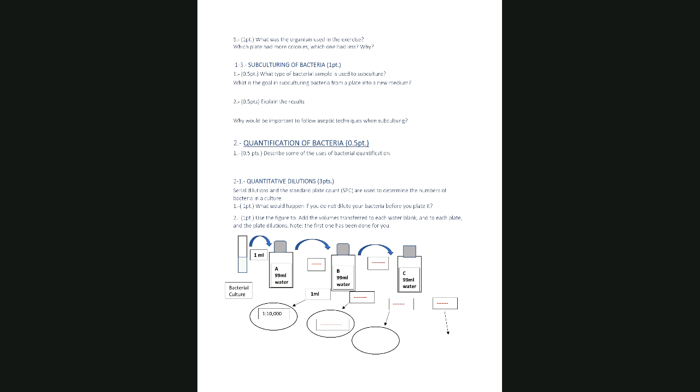So they're giving you the dilution right here, which makes a lot of sense because this is 1, 2, 3, 4. So this right here is the dilution for tube B. Let me take a look at these on my computer because Blackboard Collaborate kind of moves things.